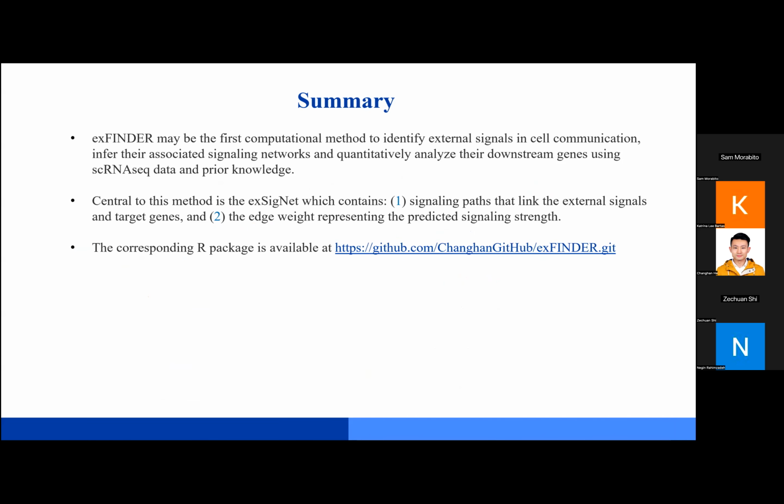The summary is that exFINDER may be the first computational method to identify external signals in cell communication, infer the associated signaling networks, and do some quantitative analysis.